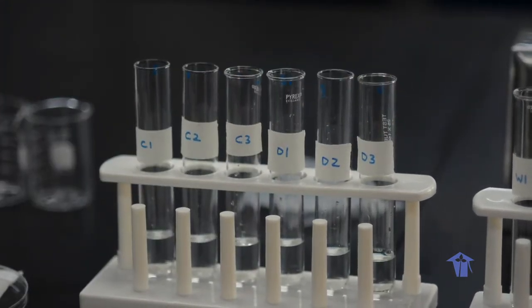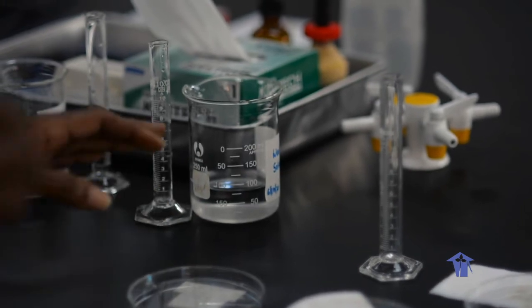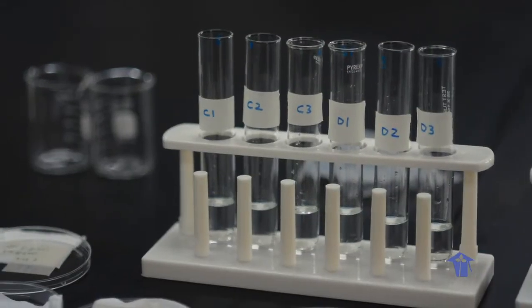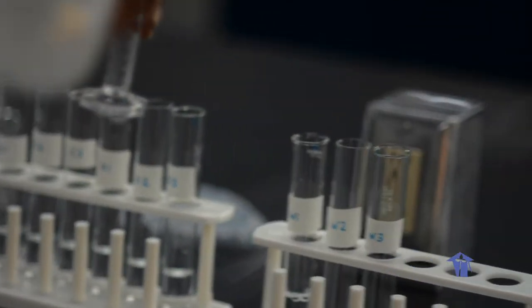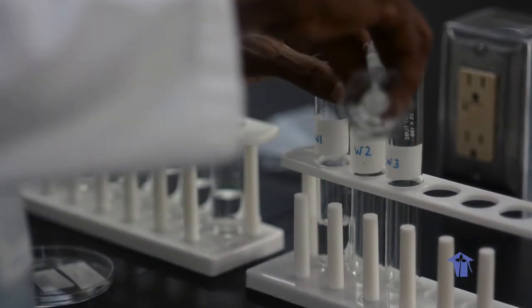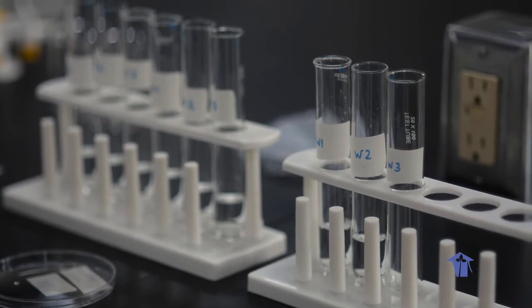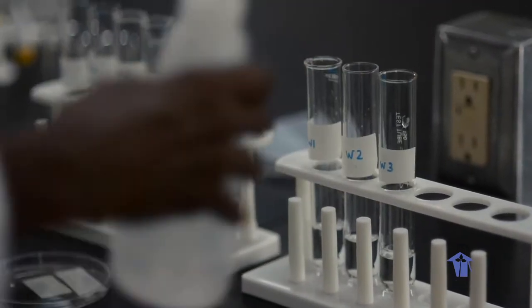Right, so now I'm finished with my measuring cylinder for measuring the dilute solution. So I'm going to place that to the side just so that I don't mix up the solutions. And the final set of boiling tubes, into those I am going to also pour 10 mils of this distilled water. That aside.